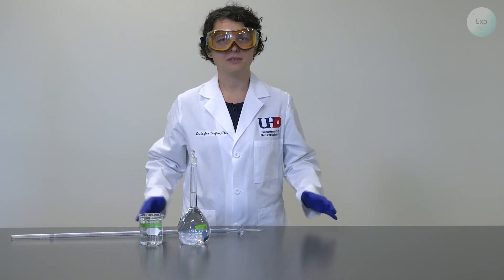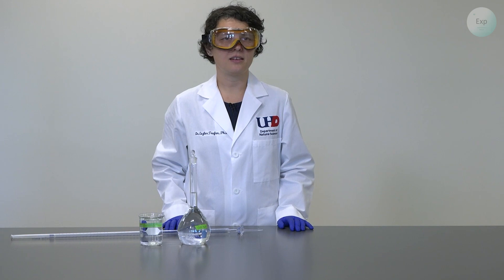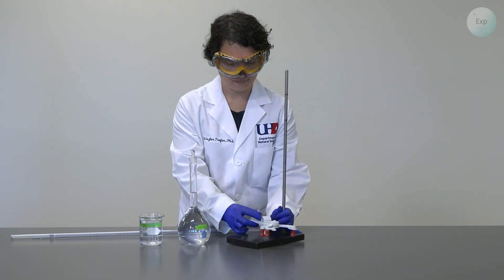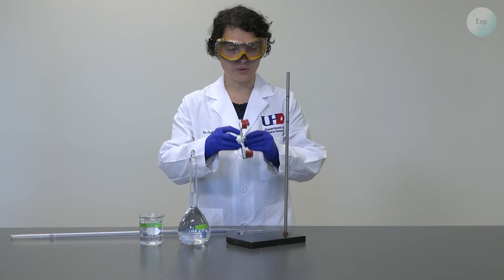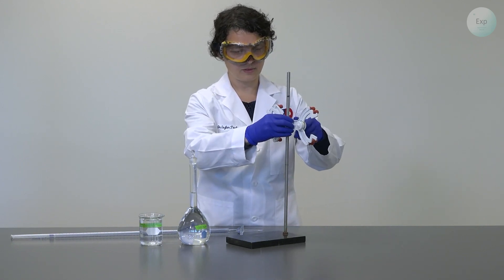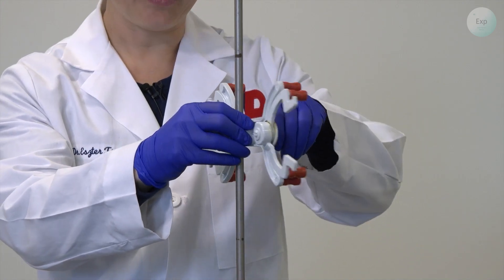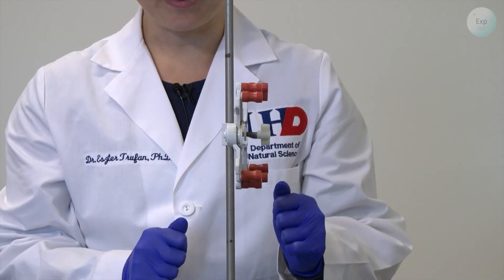To suspend the burette, we are going to need a stand and a burette holder. And this is usually how it works. The burette holder will slide right into the stand and then we tighten it so that it stays in place.